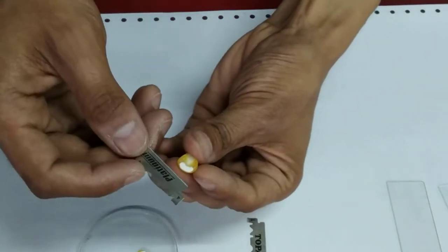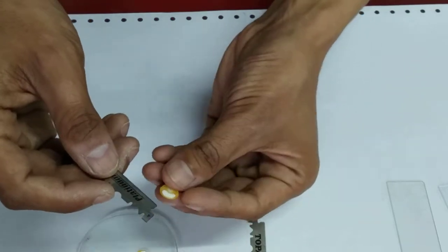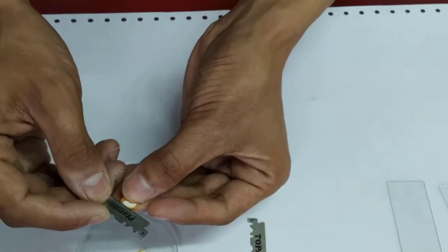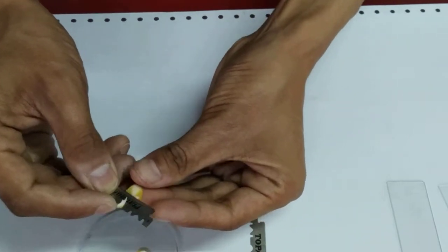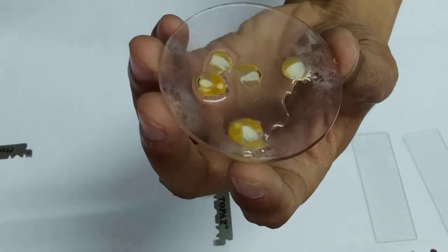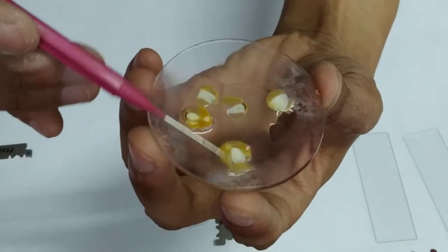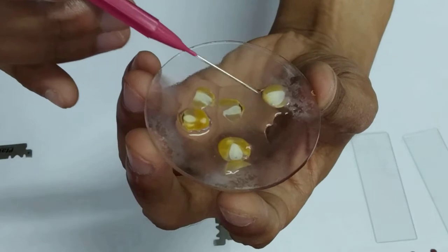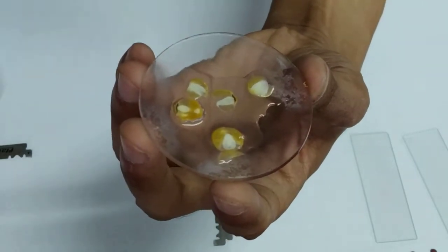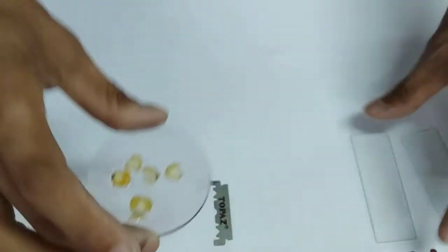We are going to cut many such sections and then we are going to select the thinnest one. So the thinnest one seems like this one. We are going to transfer this to a glass slide with the help of a brush.